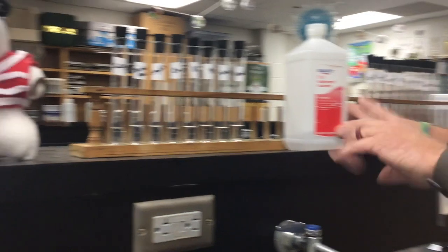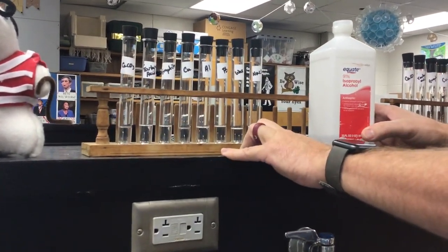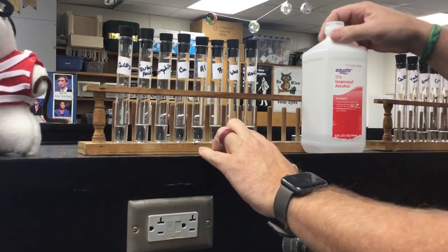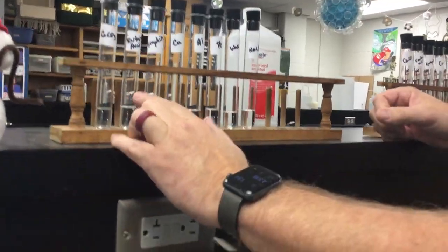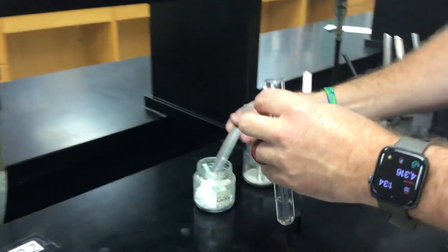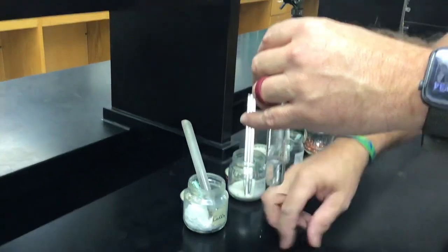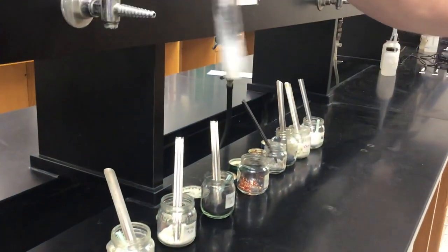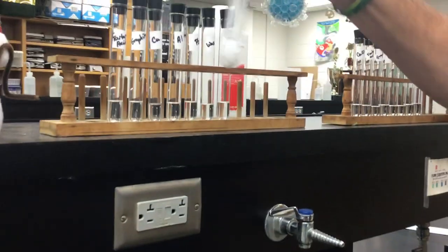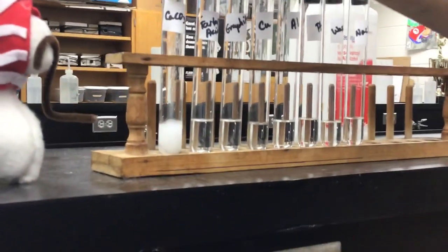So over here what we've got is isopropyl alcohol. And I put some isopropyl alcohol in each of the test tubes just like yesterday. This is not water, this is isopropyl. And so what I'm going to do is put each of the substances in there as it's labeled before. So I'm going to put in a little bit of calcium carbonate in here, and we'll shake it up and look for the solubility. So shake it up, put it in there, and we'll see what we see, and you see what you see. So figure out if you think that that is soluble in that isopropyl alcohol.